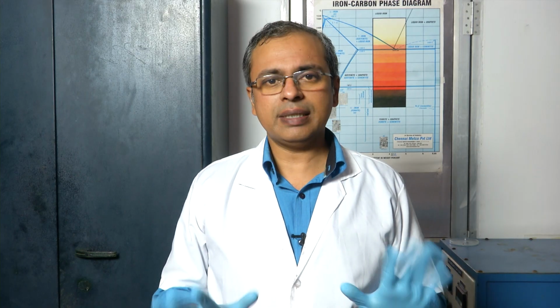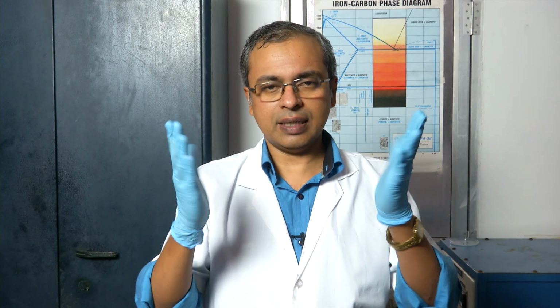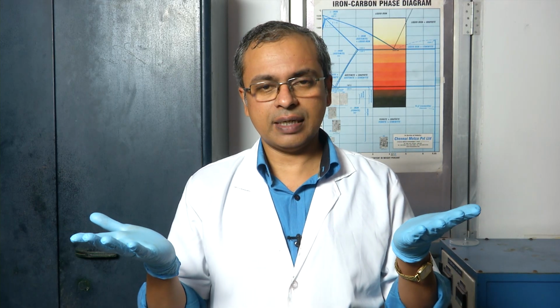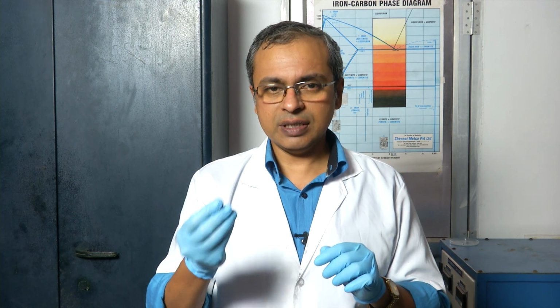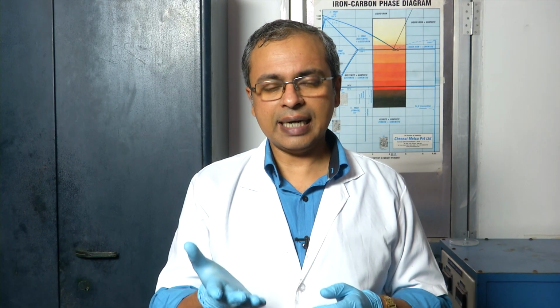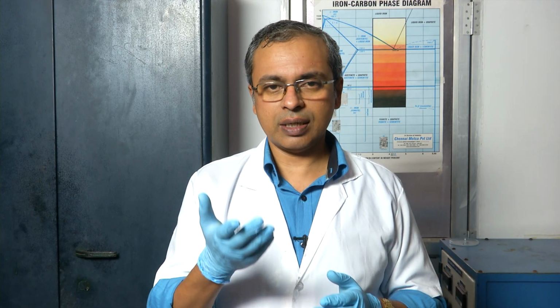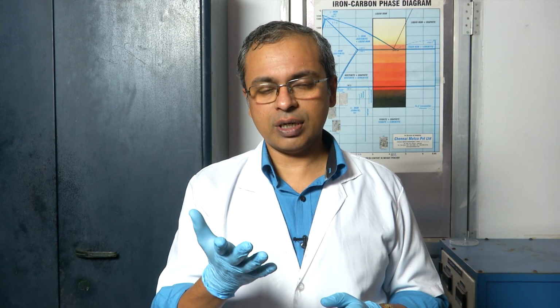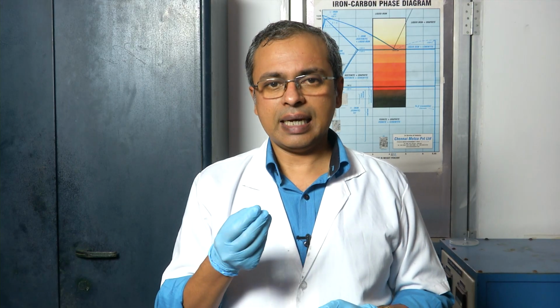The other most common thing that you should have in a lab is a set of gloves. These are nitrile gloves. I will show you other forms of gloves that are around. So, this is a standard thing that you can wear. Our first protection is our skin, and if you are handling samples, you are actually going to put samples in your hand which could then fill the pores of your fingers if you are not wearing a set of gloves. So, whether it is a carbon sample or any other sample that you are using, you do not know what is going to be toxic as a matter of routine.